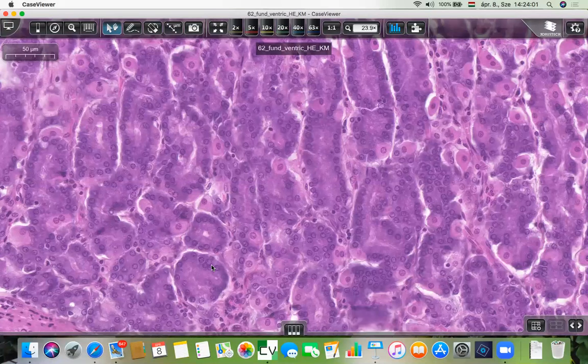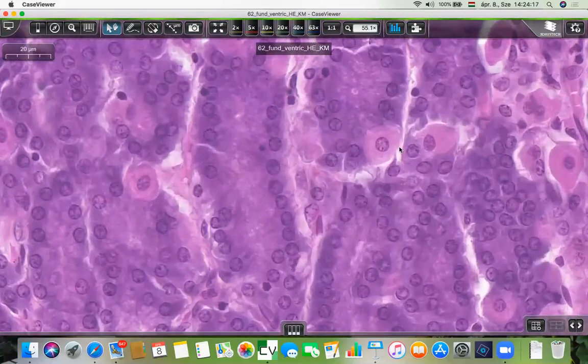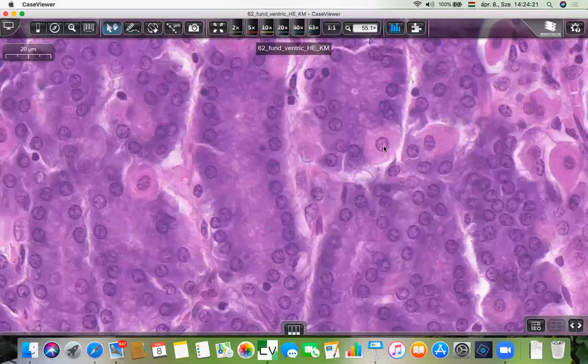Next type of cells, the parietal cells. Parietal cells are the lightly stained or eosinophilic structures with a well-presented nucleus. Sometimes they look similar to scrambled eggs. Here we have the exact egg, and there is the pinkish cytoplasm, more ovoid and much bigger.